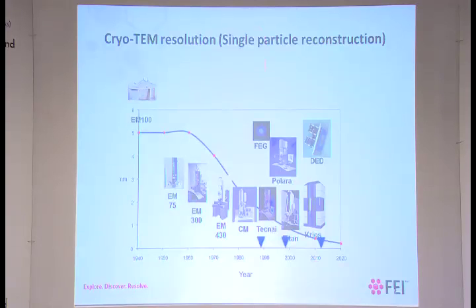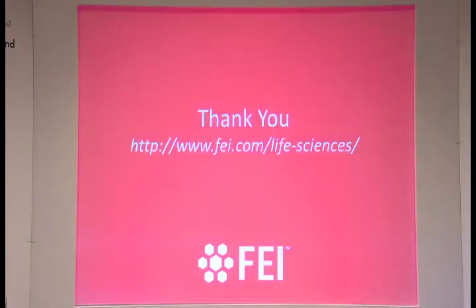And the last thing, which has been very important, is the direct electron detectors, such as Falcon 2 and soon the Falcon 3, and also the K2 from Gatan. These have been really important in pushing the resolution limits that we are currently achieving, and also making us achieve those resolution limits with relatively short collection hours. So that has been a huge improvement.